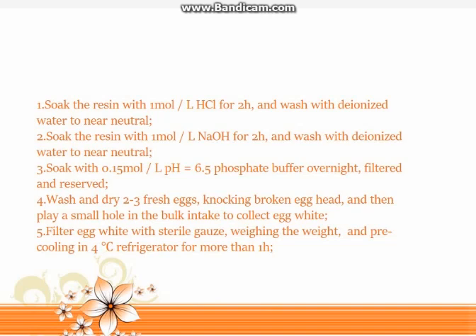Step 4: Wash and dry 2–3 fresh eggs, crack them open, and place a small hole to collect the egg white. Step 5: Filter the egg white with sterile gauze, weigh it, and pre-cool in a 4°C refrigerator for more than 1 hour.